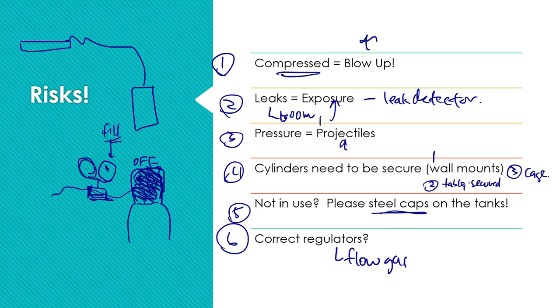The other one that I will see, because there's typically two, will actually be the flow piece. So this will help me control the flow of the gas in a more precise way that's leaving that tank. The flow, sometimes a common unit here is PSI, and PSI is pounds per square inch. So I dial it to that particular type of PSI that we need it at, and that is ensuring that the stuff that's coming out of this tank is actually flowing through and making its way where it needs to go with the right amount of pressure or the right amount of flow.